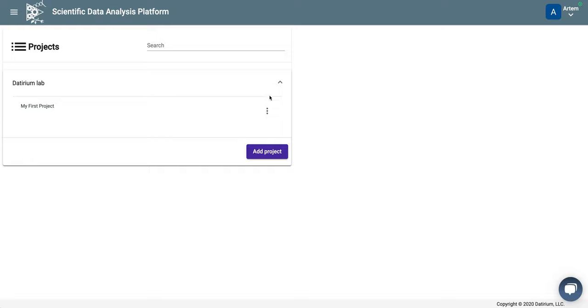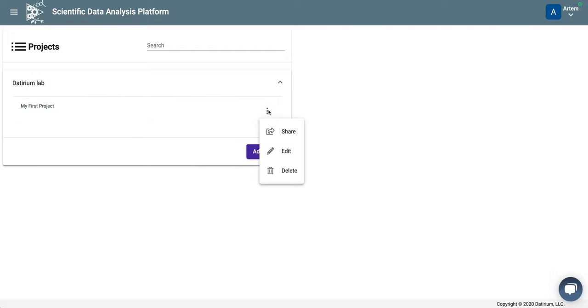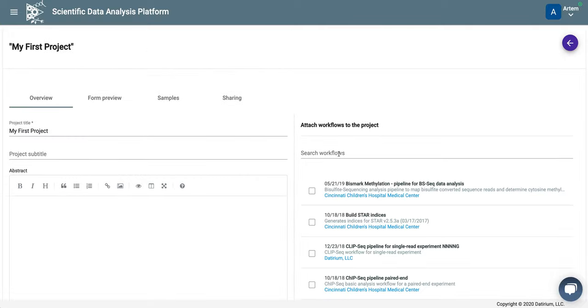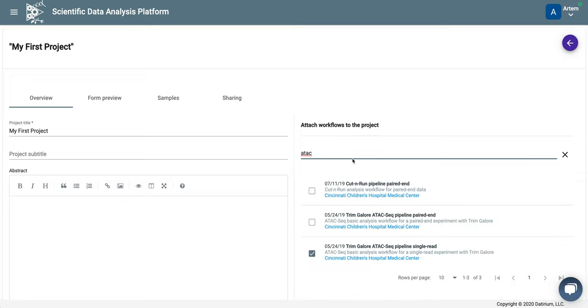So first, we will go to the features of the project by clicking at this three-dot menu and going to edit. And we want to make sure that we have ATAC pipeline attached to the project.